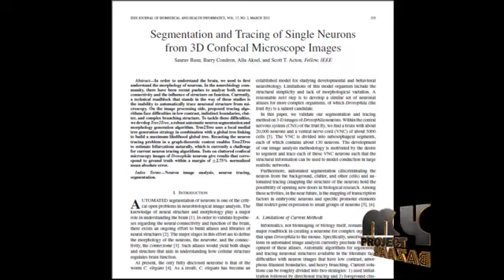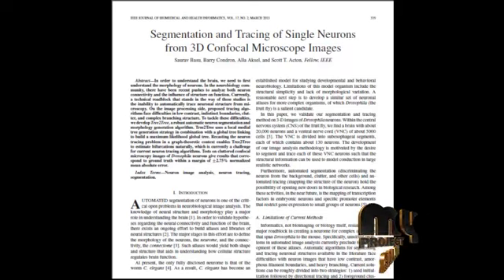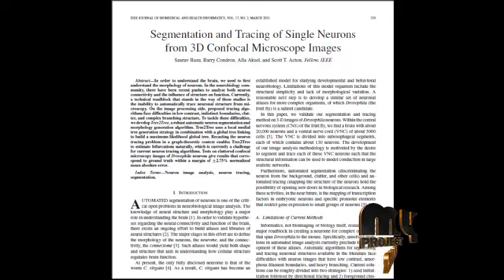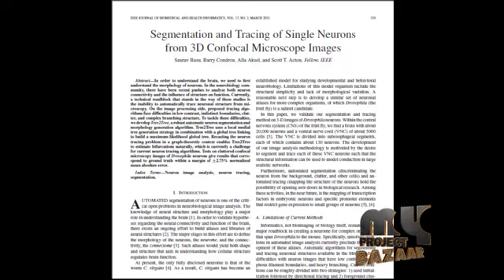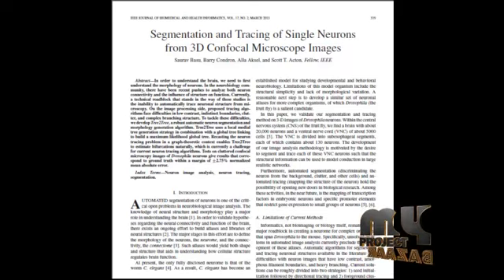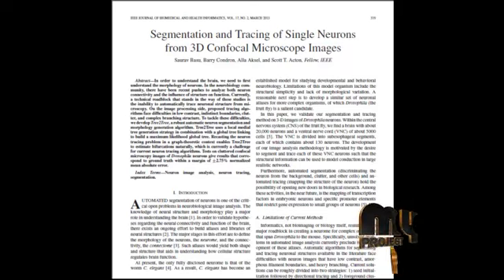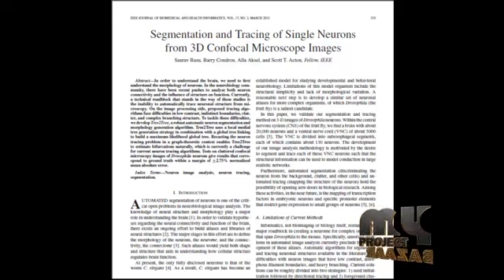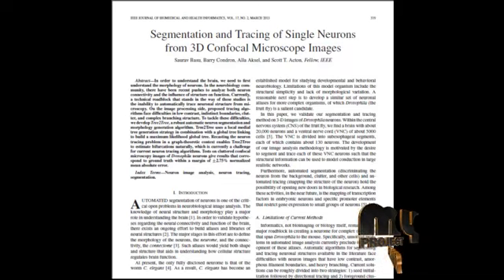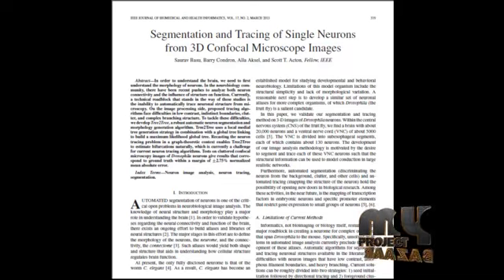The binary image is segmented by the Hessian-based method. This method determines whether each pixel belongs to the neuron structure. If it belongs to the neuron, the pixel is marked as 1; otherwise it is marked as 0.